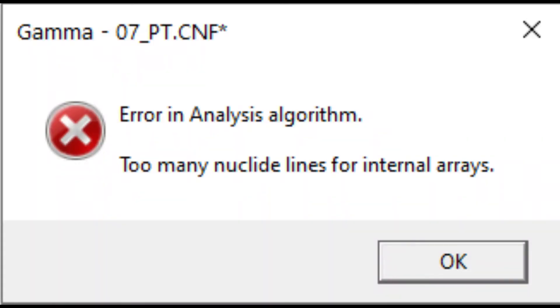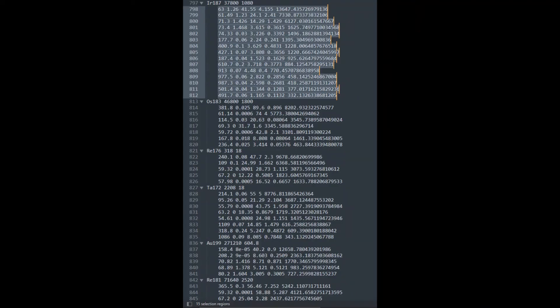Meanwhile, the too many nuclide lines error is counterintuitively caused by having one nuclide containing too many lines. In this screenshot, you can see the quote-unquote widest nuclide is only 15 lines wide.